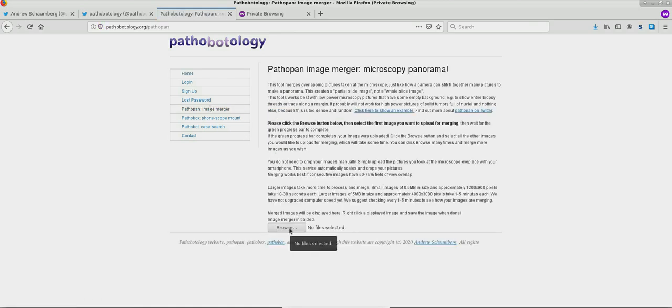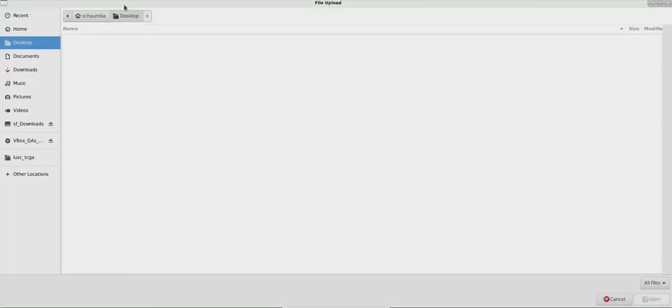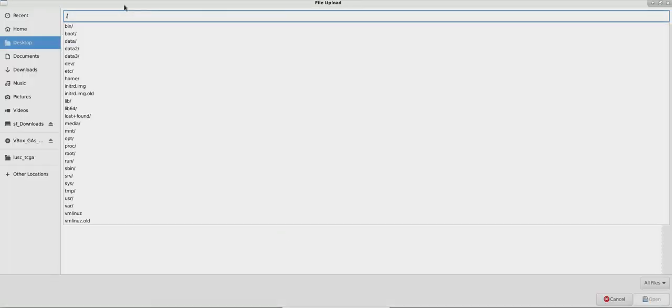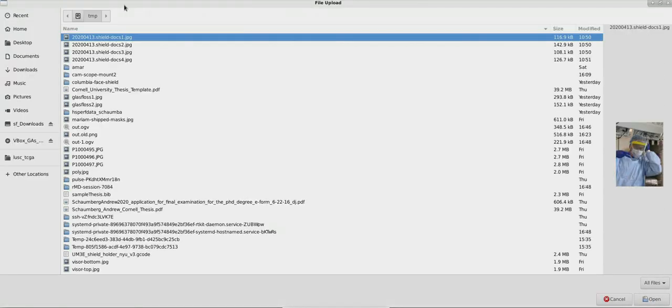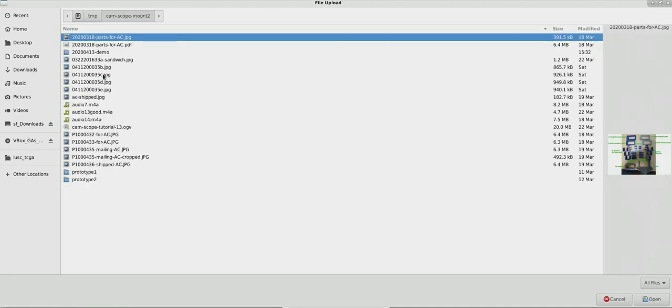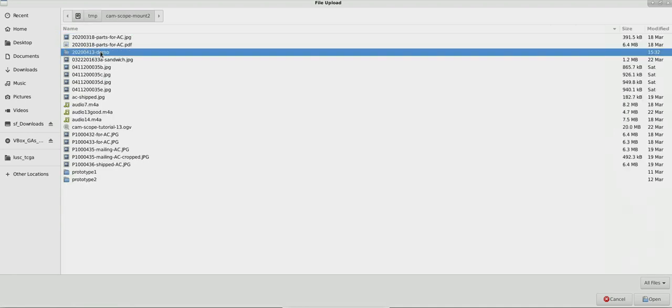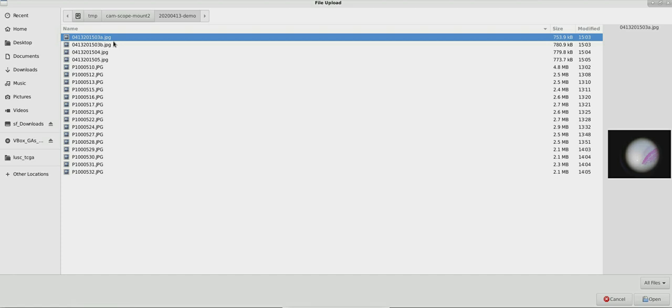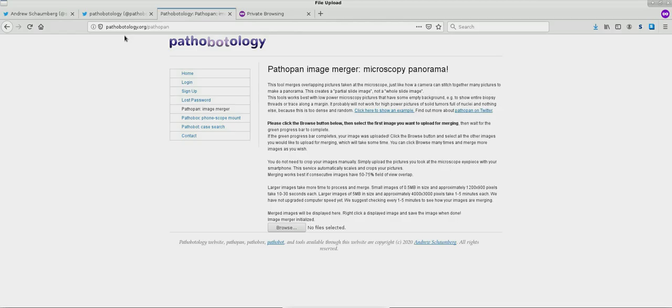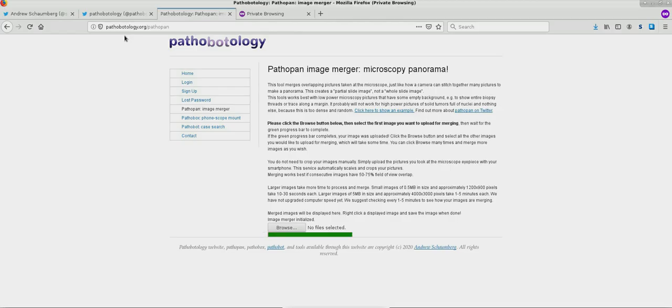Use it by clicking this browse button and selecting the first image that we would like to use to merge together with other images. So I'll go ahead and select that first image. We see the green progress bar below has completed. That's good. The image has uploaded successfully.